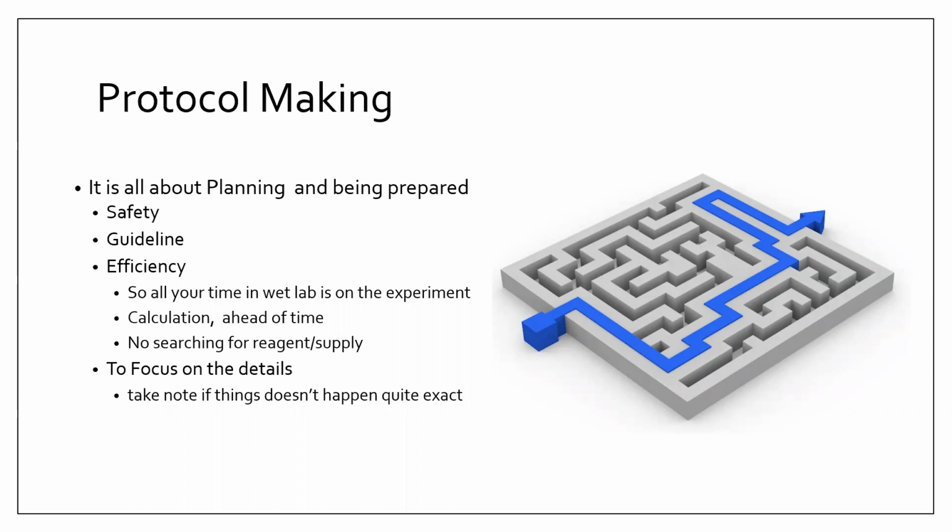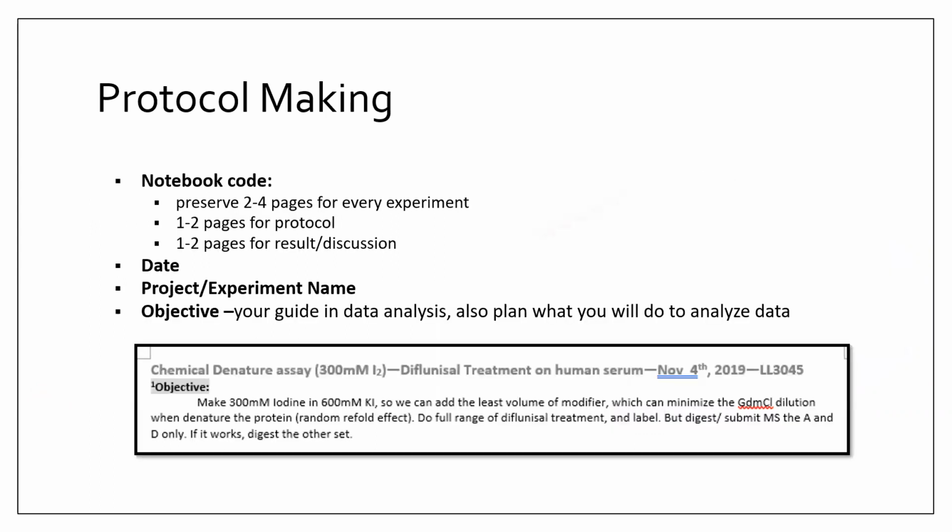Okay, so we talked about why protocol is important in the last video. Protocol is important to guide you through the experiment, help you mind the details, and ensure your safety and efficiency. Now we're going to talk about what exactly a protocol is made of.